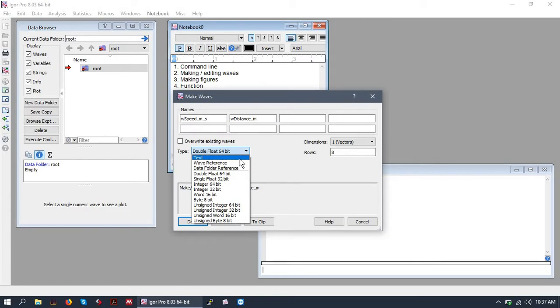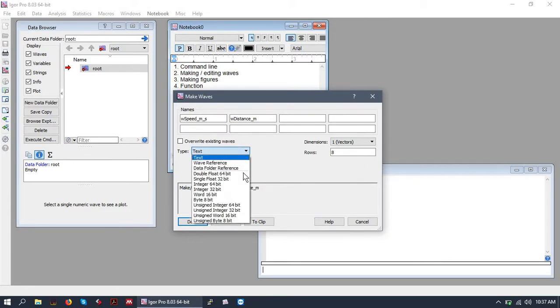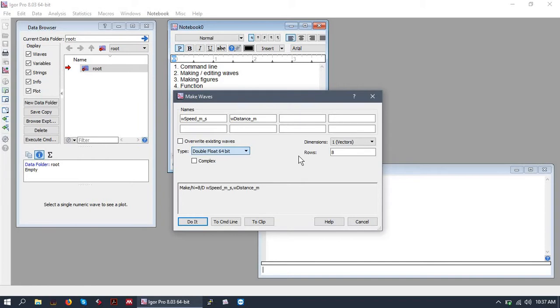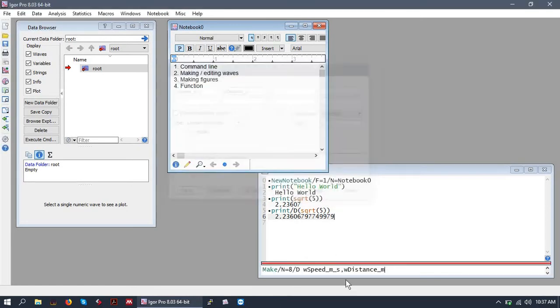And the other type, like I said, that you will use is a text wave. We'll make one of those in a second. But first, let's make these two waves as double float 64-bit. And do it.